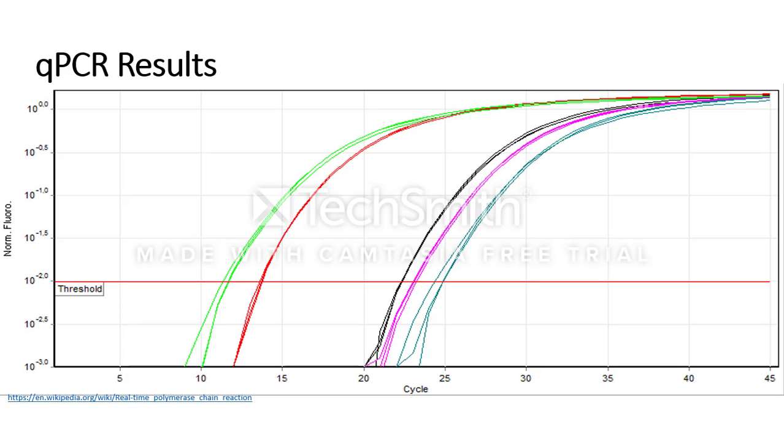What results are expected for qPCR? Once the endpoint is reached, the number of copies of DNA is analyzed and compared with the fluorescence of a known standard in order to generate a comparison curve to identify amount of cDNA in an unknown sample. All samples are compared to the standard or housekeeping gene, as it's considered a stable value for gene expression analysis.